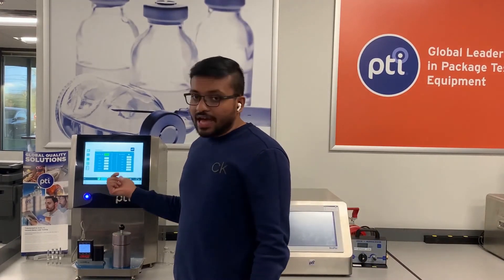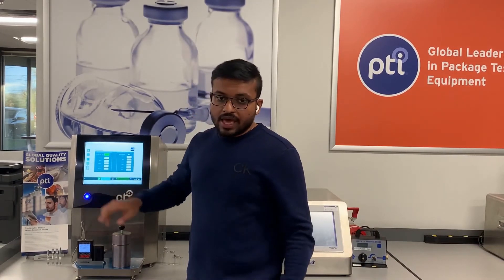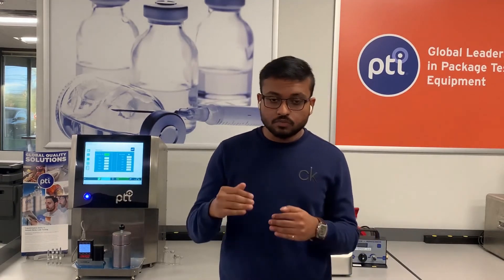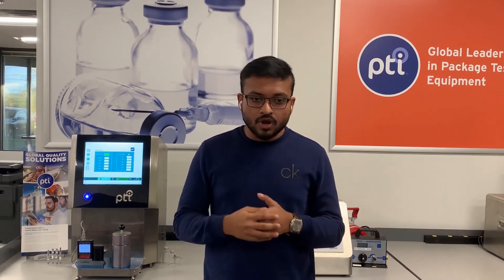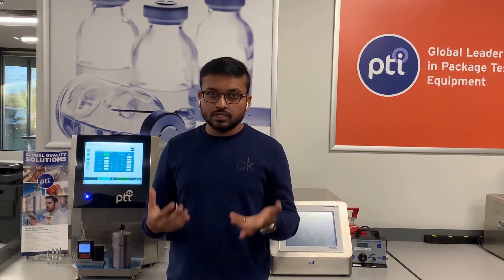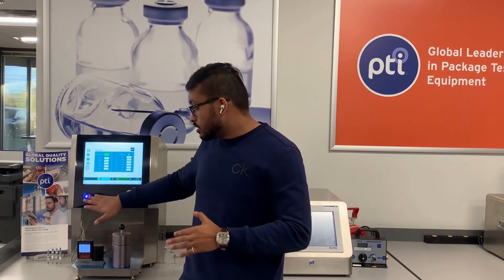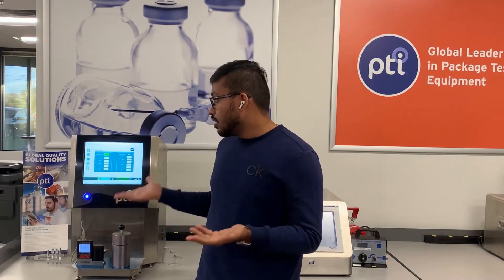One of the other cool features that we have added is the auto-calibration feature in the Varapak 465. Once we turn on auto-calibration mode, we just press the blue button, it runs the full calibration, and spits out the data with the proper commenting with different flow rates. With that, our whole calibration process is automated now. We have added a lot of extra features, but we have kept it really simple for operators running the machine. It still runs with just a press of a single button, you can still abort your test with this button, and any error can be denoted with the lights from this button.